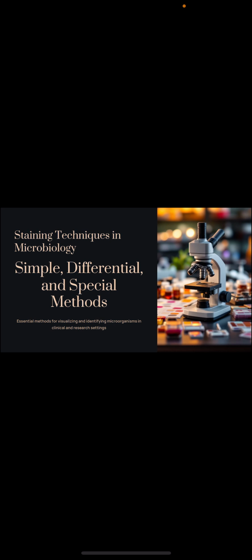The topic of my today's presentation is staining technique in microbiology. What is a staining technique? First of all, staining technique refers to a method used in microscopy to enhance the contrast of microscopic structures or cells by applying colored chemicals. By saying colored chemicals, we are referring towards dyes or stains.